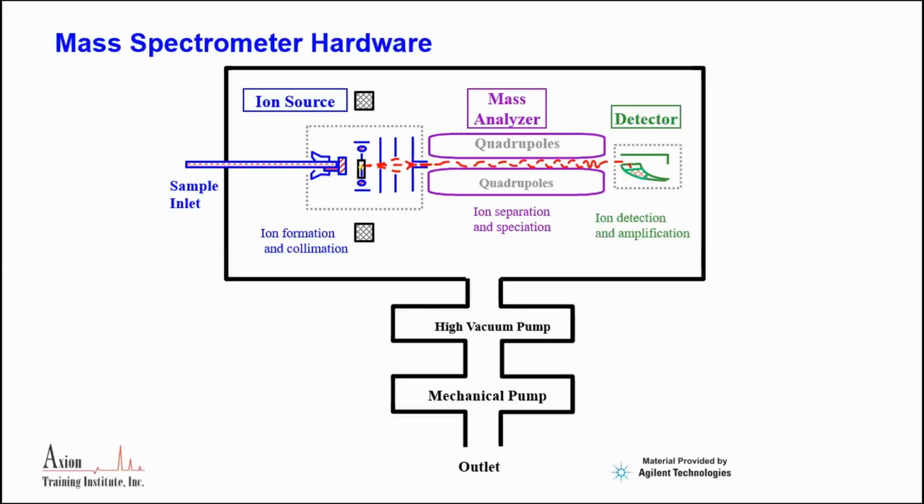What's the mass spec do? And I made the comment that we're going to weigh the molecule. Now, you realize there's no way to weigh a molecule. I mean, we're not even close to the technology to weigh a molecule, but we can get at the molecule's molecular weight indirectly by putting a charge on that molecule.